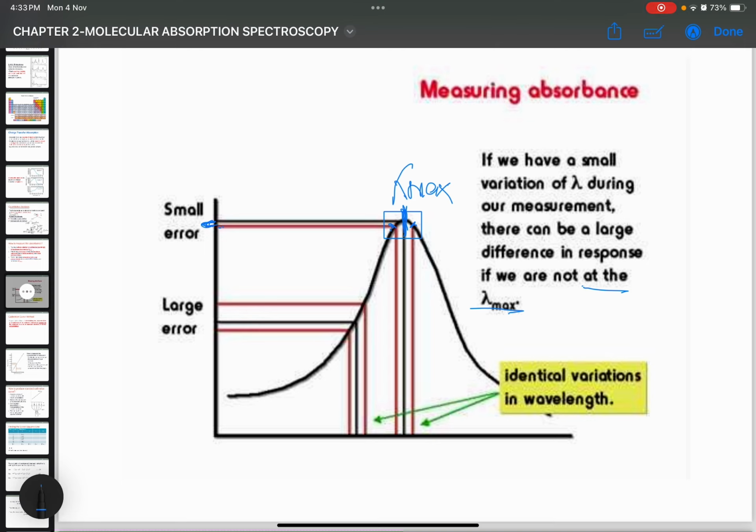why some samples are suitable to use the calibration method and why some samples are suitable to use standard addition methods. Okay, and the second is what is the difference between calibration method and standard addition method. How the procedure, kalau saya boleh kata procedure lah kan, tapi sebenarnya it is not called procedure. What is the step or what is the principle for calibration method dengan standard addition methods? Okay, first we look at the calibration curve methods.